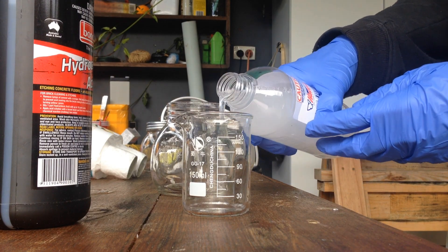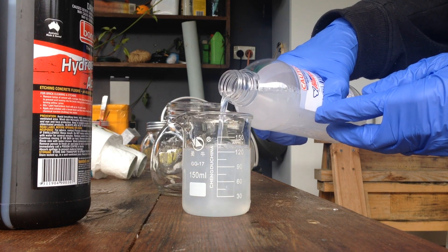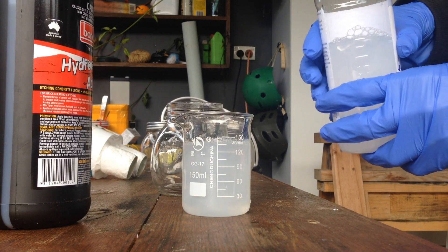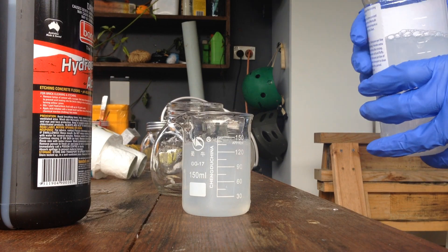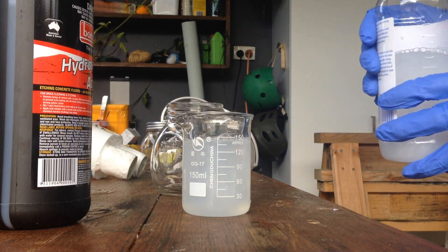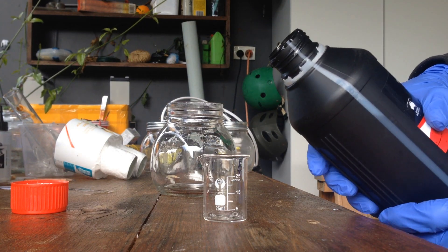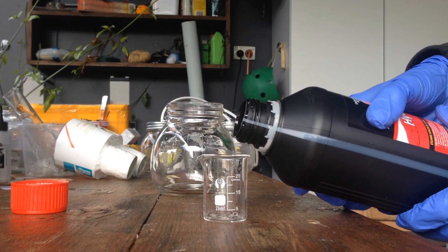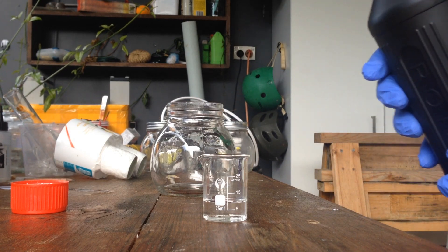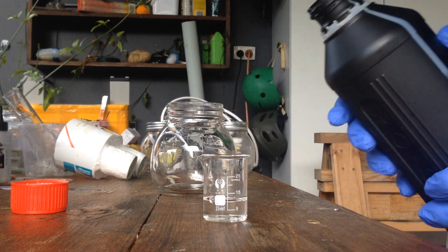Let's pour the ammonia in until we get around 145 milliliters. Actually, we'll do a little bit less than 145 in order to get a slight excess of hydrochloric acid, so that when we finish the reaction, if the pH isn't 7 neutral, we can just add a little bit more ammonia to balance it out. And we'll pour just 10 milliliters of hydrochloric acid. Perfect.